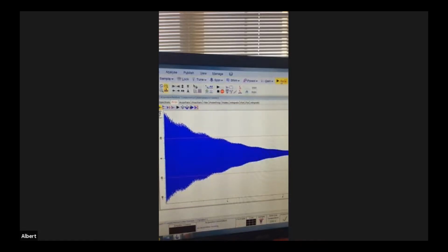Oh, it's done. Is it done? Yes. So you can't use that, right? You need to transform it. So GR, hit enter, hit FT. Fourier Transform is just a mathematical calculation that's going to convert that graph into a readable spectrum. So go ahead.